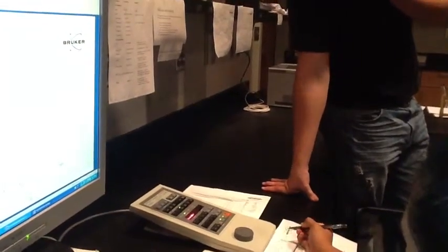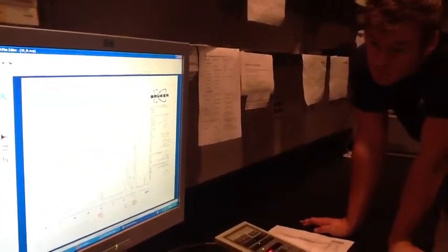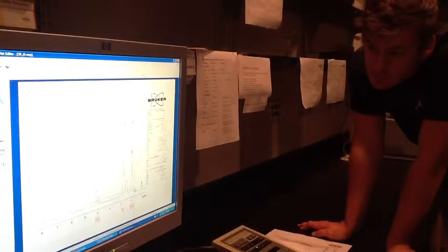I know how to do the math part, but what you're... In this region, you should expect multiple peaks, right? And you won't be able to assign all of them, but you should see an integration for 6 for these hydrogens. And you should see integration of a 3 here and a 3 here, right? Here, it's just giving you integrations of what it thinks relative to this hydrogen, the hydrogen that the bromine is attached to. So if you want to scale it, then you would have to see, this is 0.5 to 3, therefore it's 1 to 6.